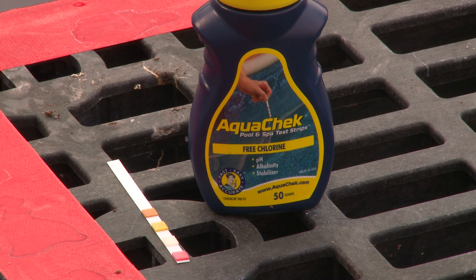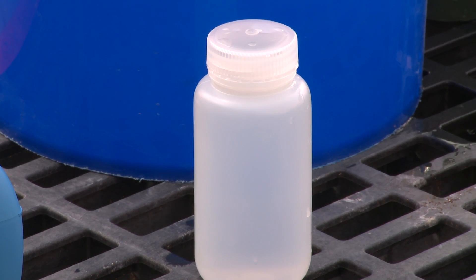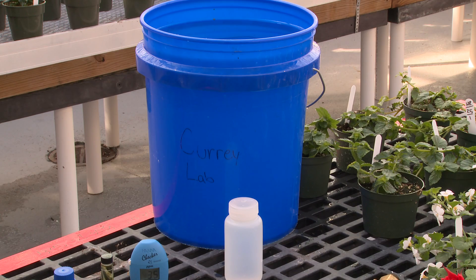These three different methods of testing alkalinity are going to range in both cost and precision. For the test strip kits, it costs around 10 dollars for the entire jar of strips, but it doesn't give you a precise value. The meters can run from 40 to 75 dollars and give you a better, more accurate reading. And finally, a commercial sample submitted to a lab may cost between 20 to 40 dollars per sample, but is going to be the most precise measurement of alkalinity in your irrigation water.